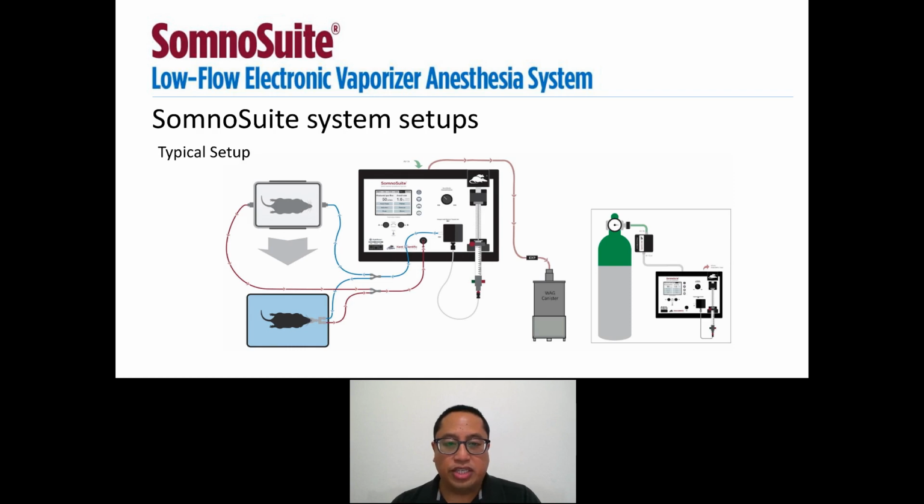If you choose to connect your SomnoSuite to compressed gas, the incoming pressure from the gas tank must not be higher than 15 psi in order for the SomnoSuite to work properly. In the small diagram, a preset pressure reducer is connected between the compressed gas tank and the SomnoSuite to bring the pressure down to 15 psi. If you do choose to use compressed gas, we are more than happy to discuss your setup with you.